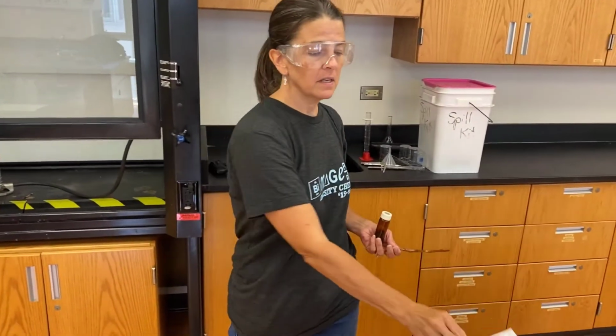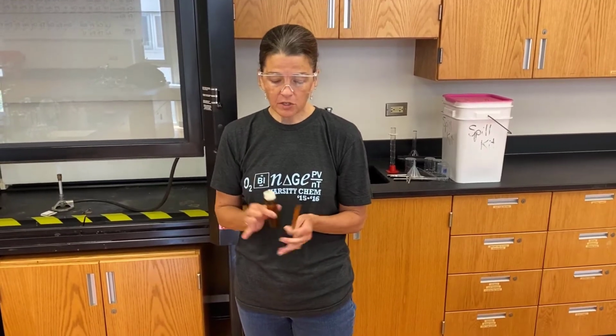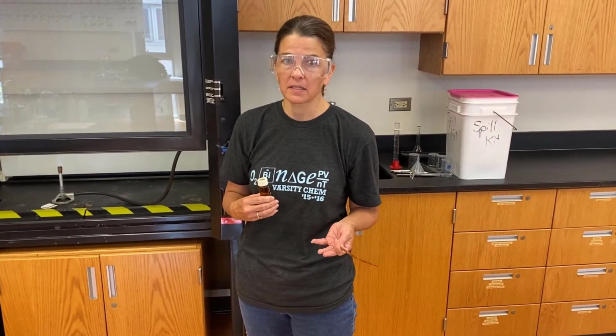Okay, so this is a lab on the law of definite and multiple proportions. Your goal today is going to be to determine the formula of a compound of copper and iodine. Now, what's going to happen is I'm going to show you the overall reaction. You will be provided data so that you can actually have data from the analytical balances.